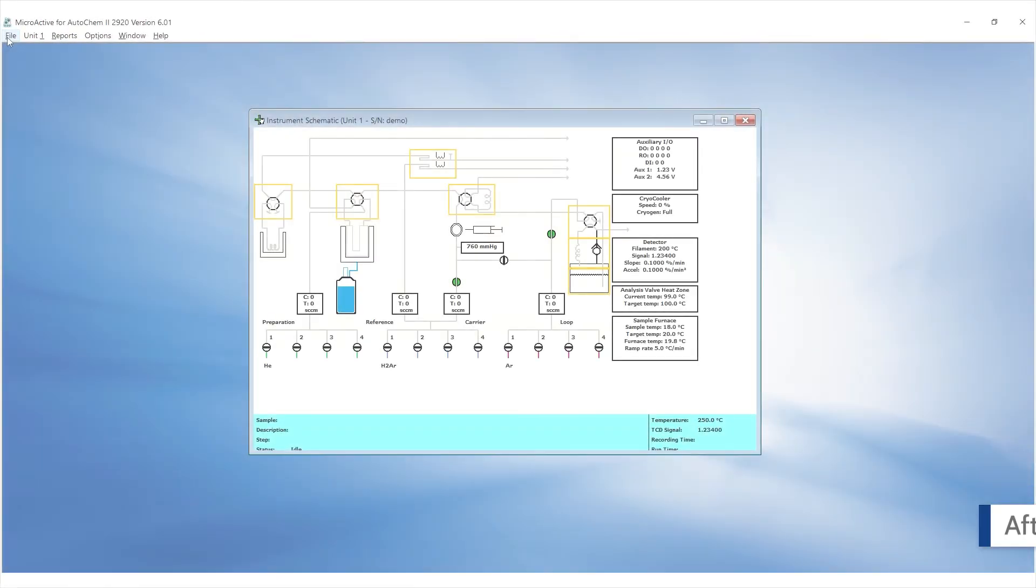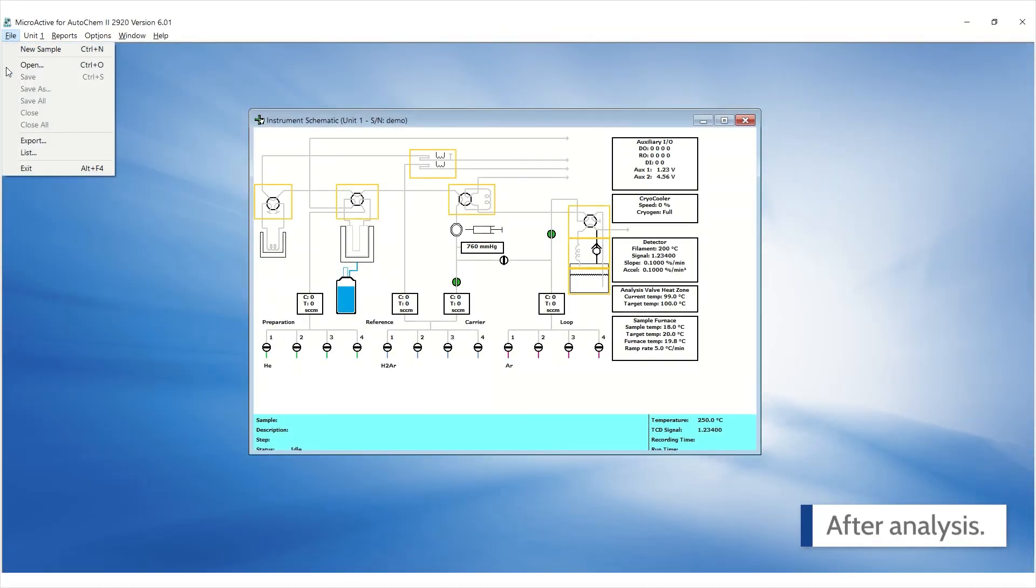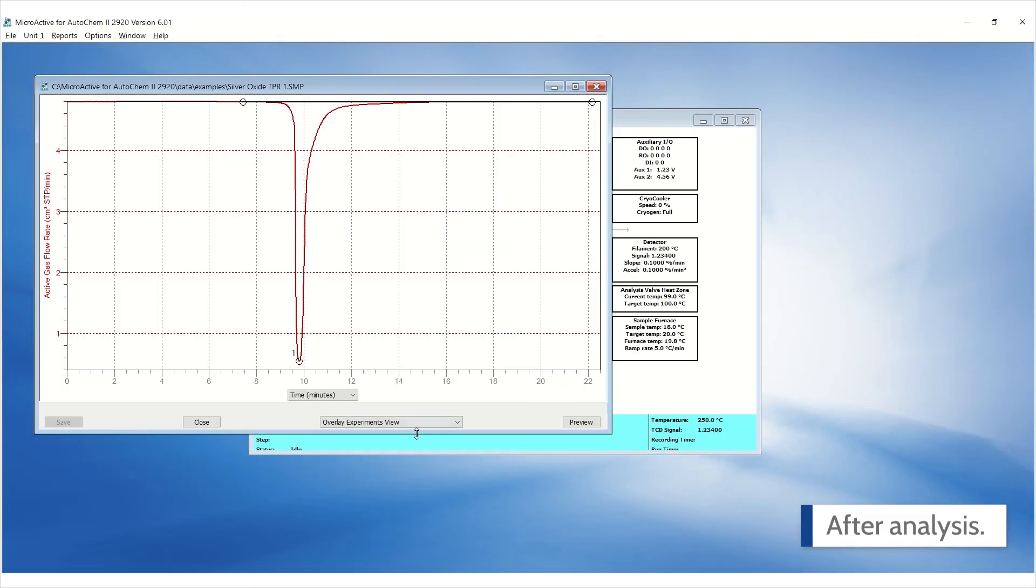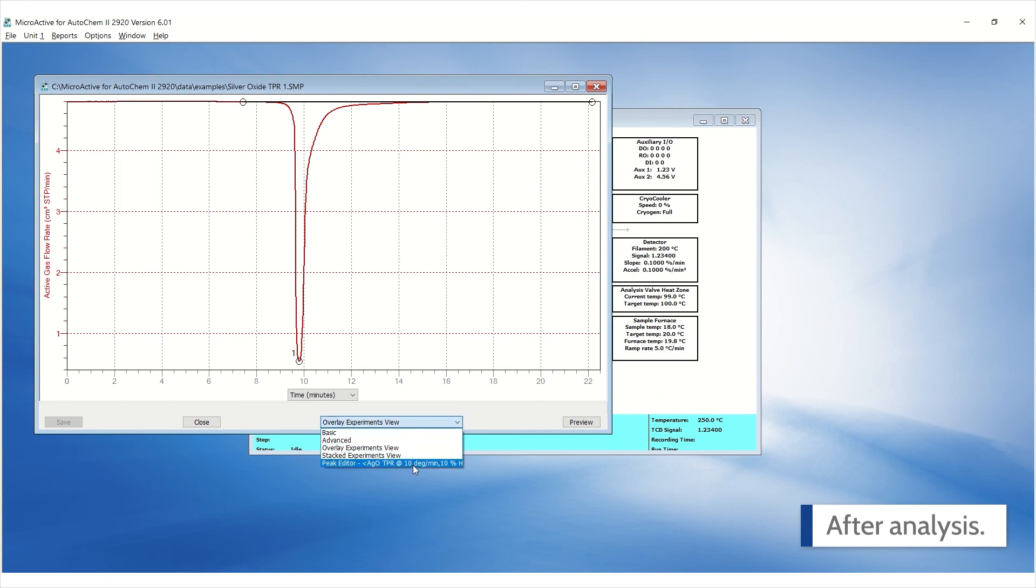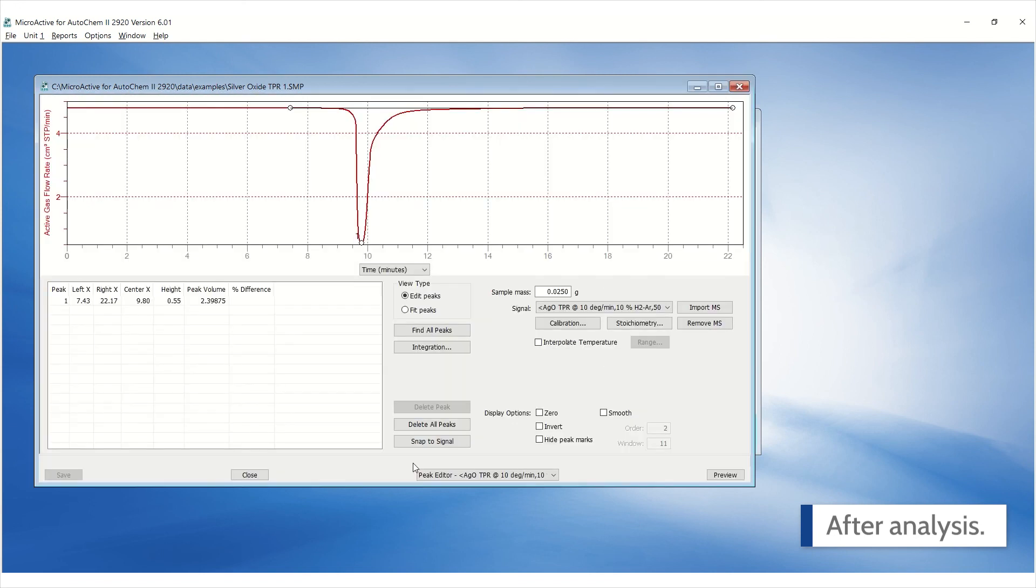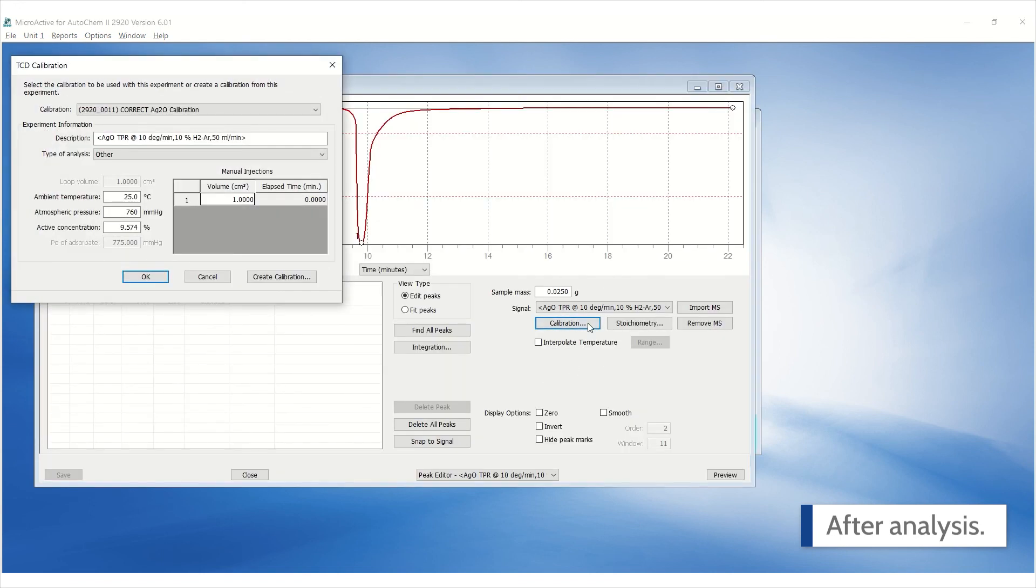If you ran the calibration after performing a TPR on a sample, go to Peak Editor, click on Calibration, and select the appropriate calibration curve.